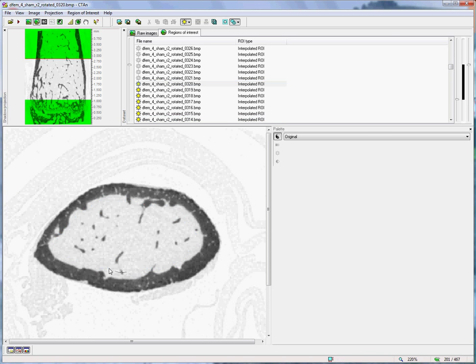And, as such, it should only be done by one analyst for any particular morphometric study.